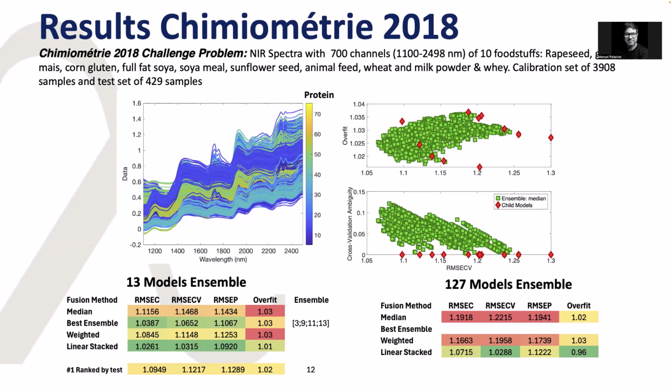Yeah, and that's another thing we know: when we interrogate the chemometrics data set in this way, we are not separating by different kinds of foods, and it also behaves non-linearly. This again starts hitting the same realm of the errors with non-linear methods. So that's why we think it was interesting to see these results.